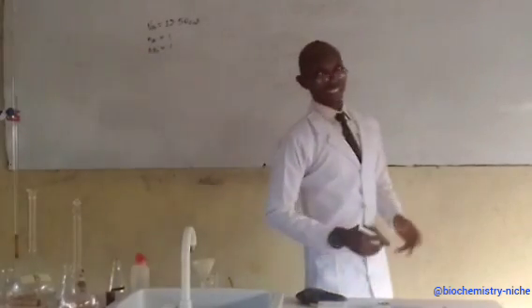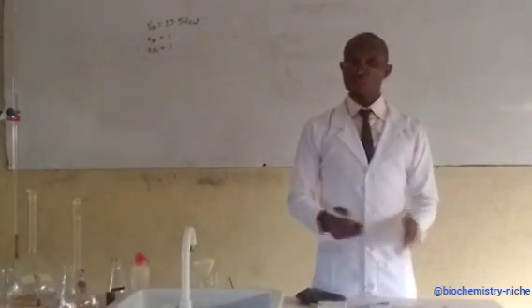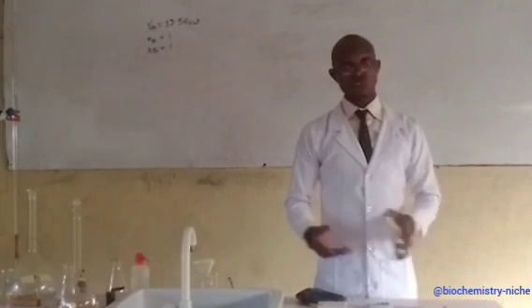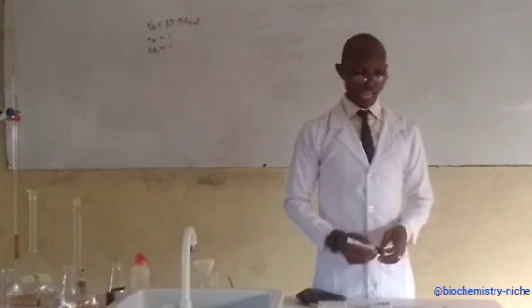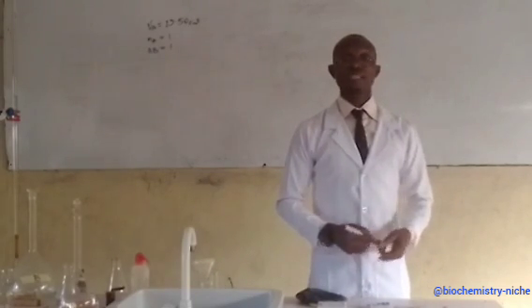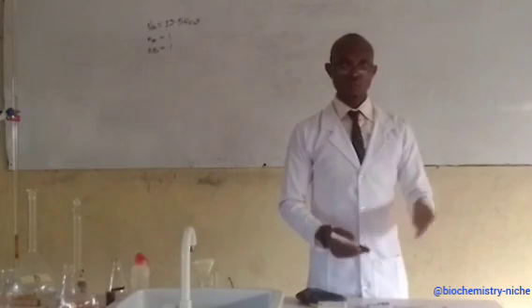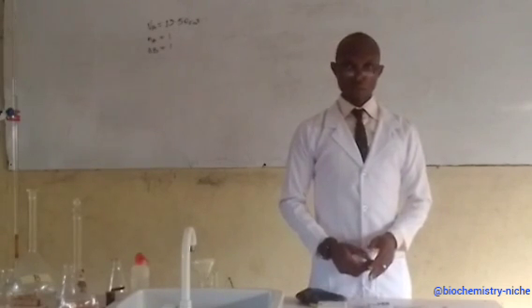So let us see. In case you are given the question to have some parameters, let me just list out a few parameters here depending on the kind of question that you probably will be asked. If you are asked questions on percentage impurity, definitely you will be given percentage purity and the rest of them.